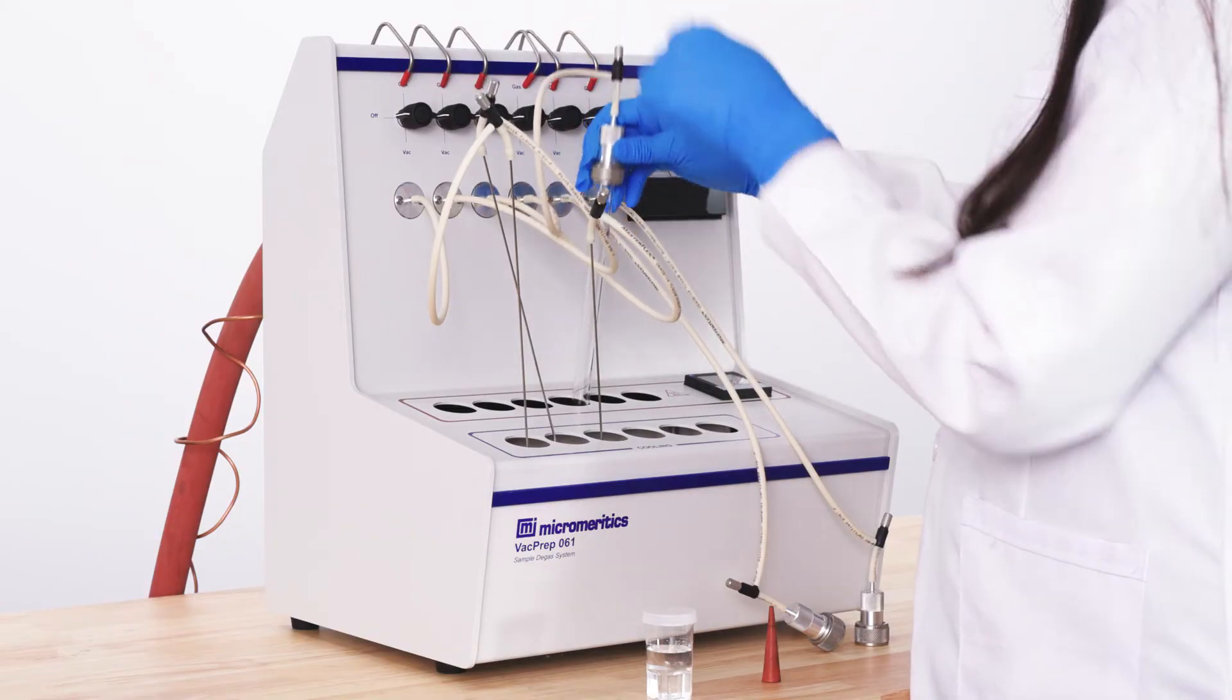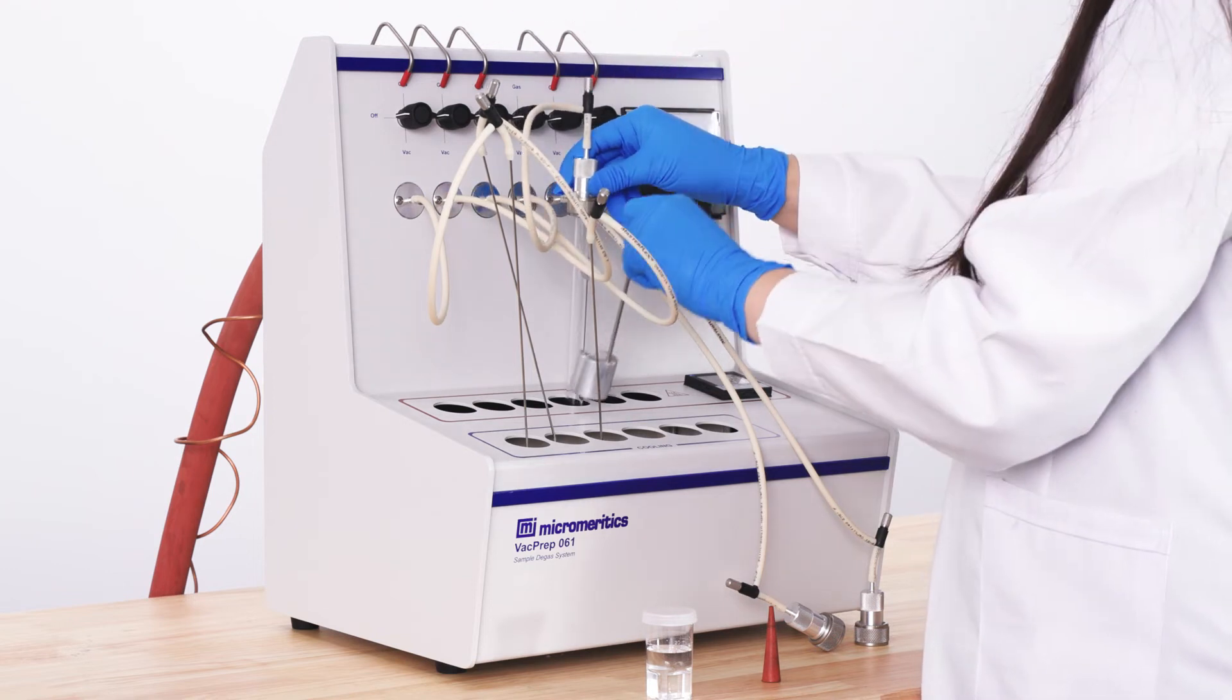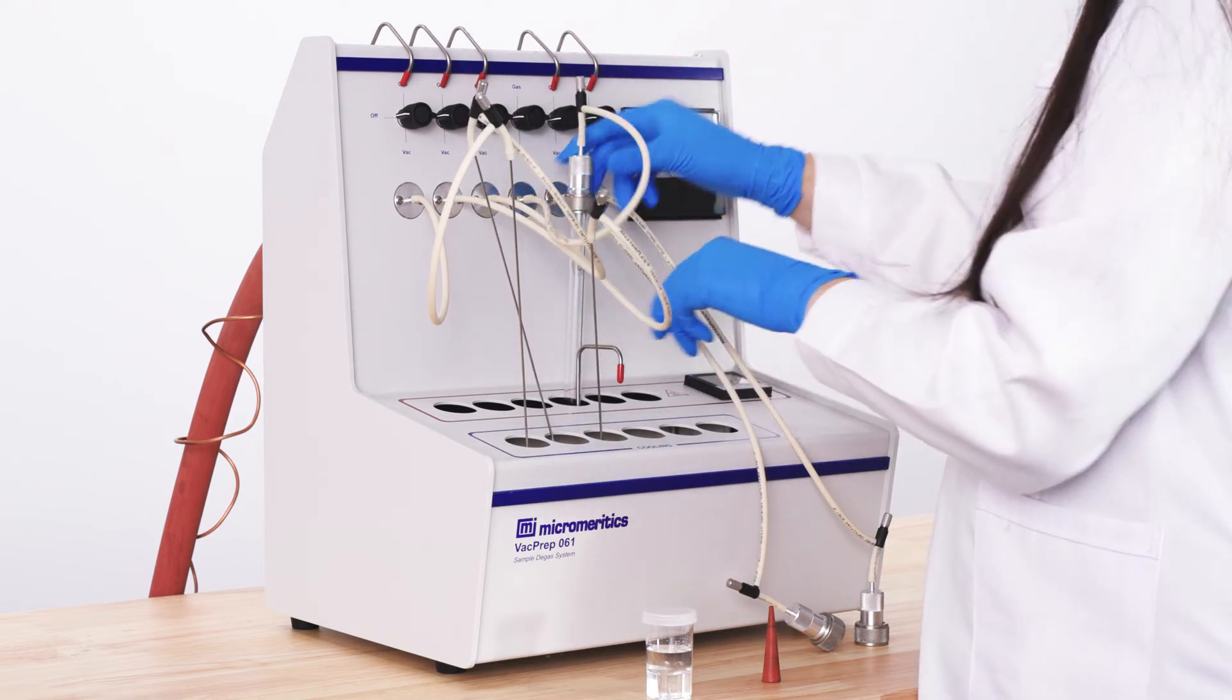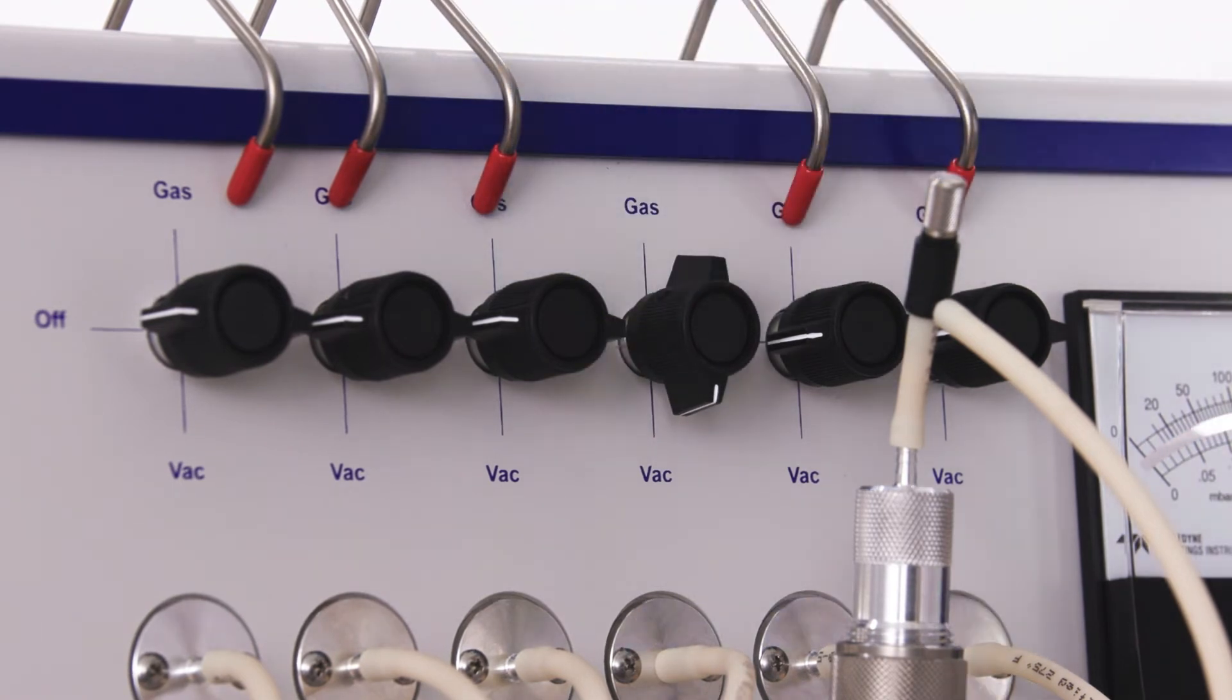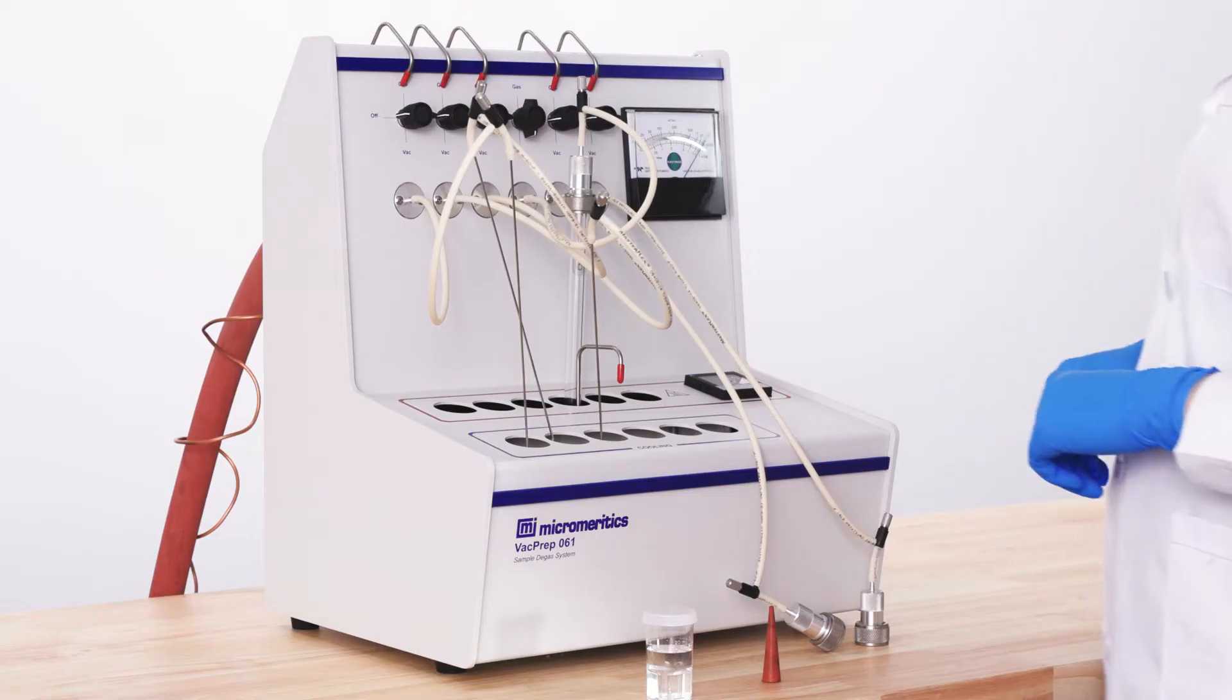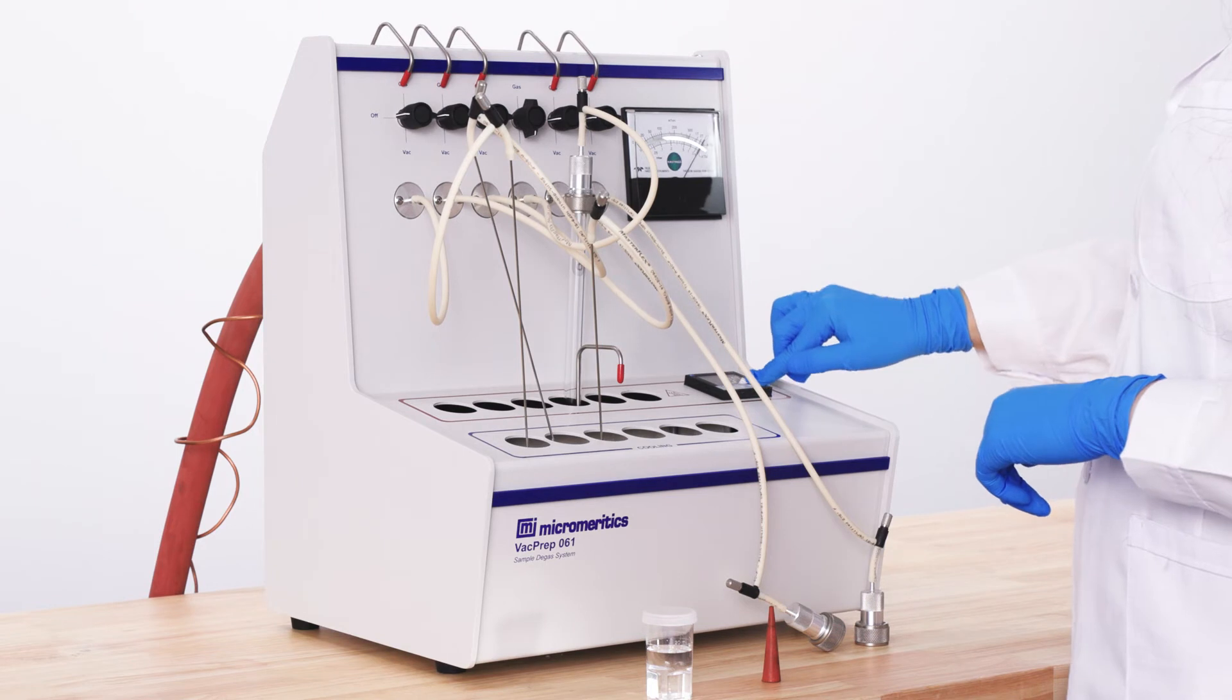Place the tube into the heating station. To begin pulling a vacuum, turn the knob for your desired port downwards toward vac. Adjust the temperature using the arrows on the keypad.